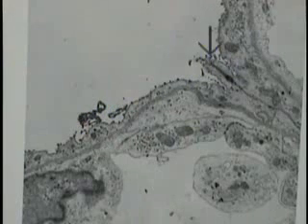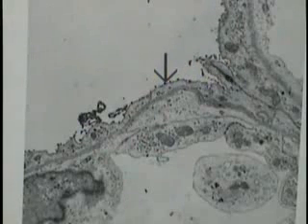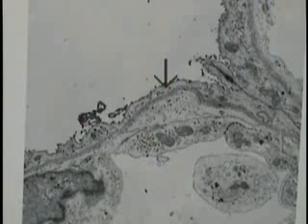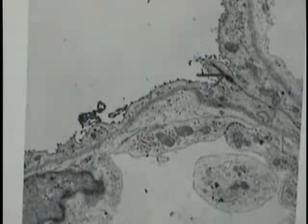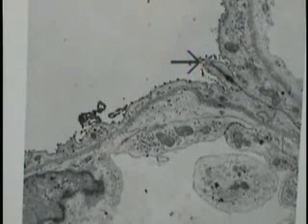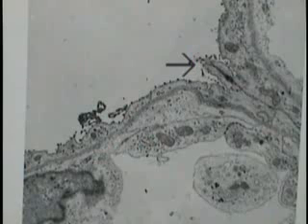This region here is a junctional complex between the type 1 pneumocyte shown here and the type 1 pneumocyte shown here. So this is the junctional complex and forms those ridges as seen with the scanning electron microscope.